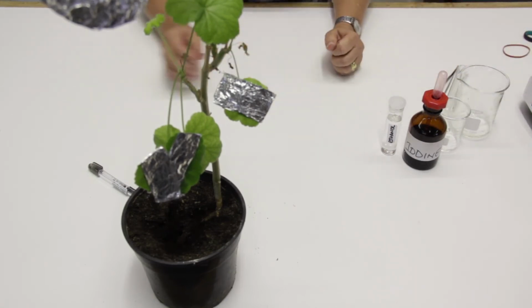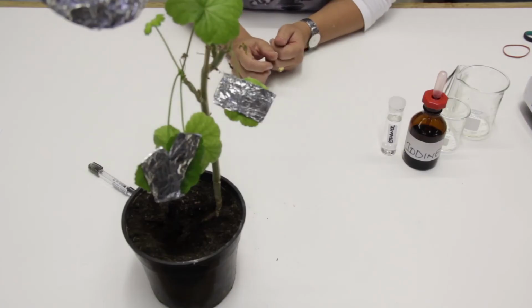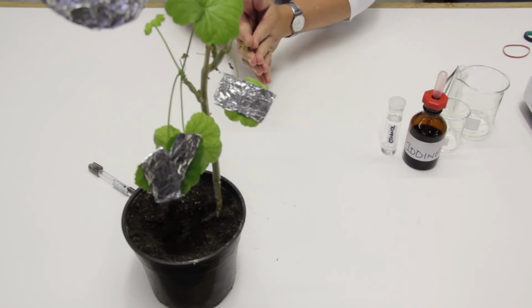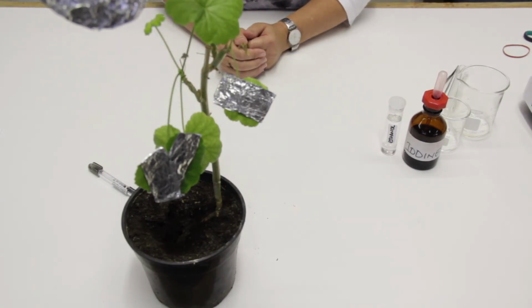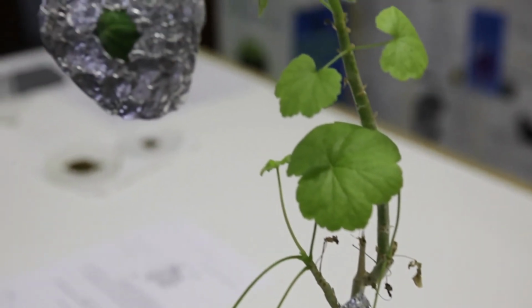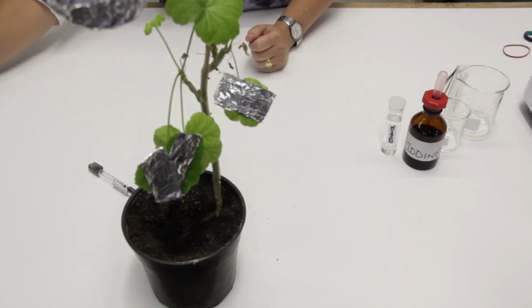The method of this practical would be, once you have destarched the plant and covered parts of those leaves, you would allow this pot plant in the sunlight for at least 4 to 8 hours. Once we have done that, I would remove a leaf from that pot plant and repeat the test for the presence of starch in the leaf.